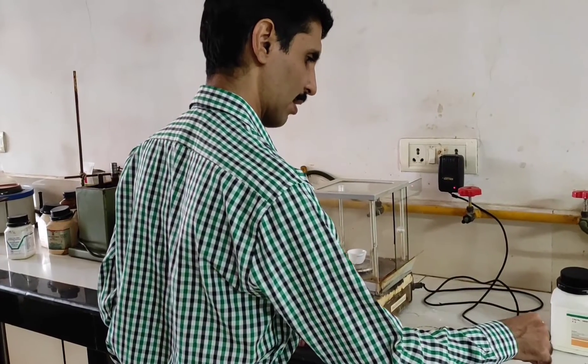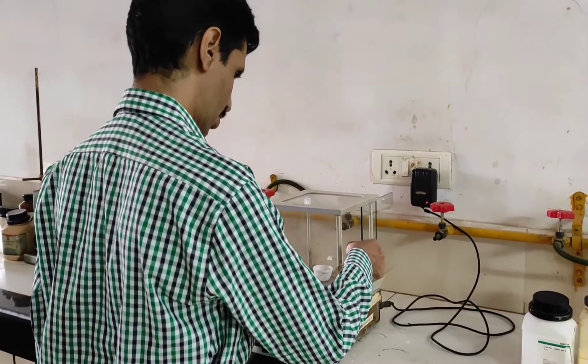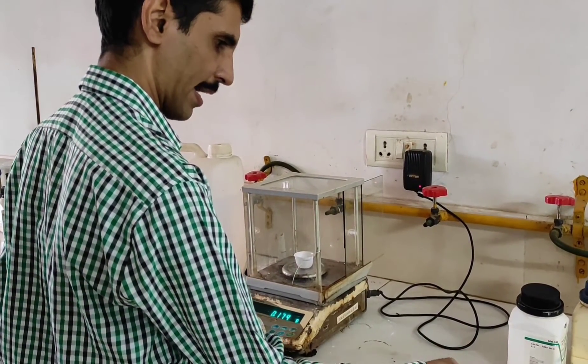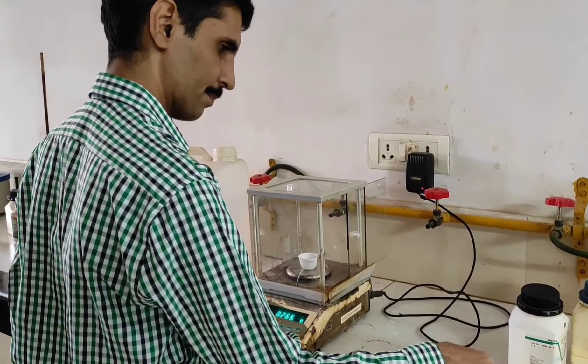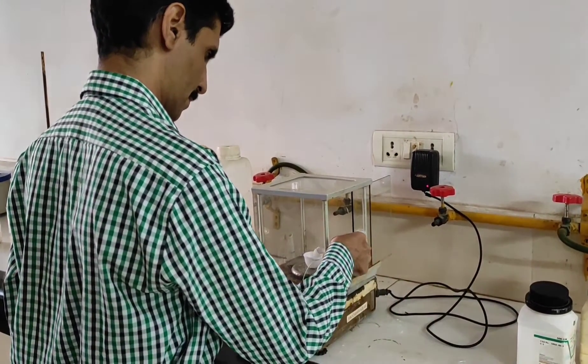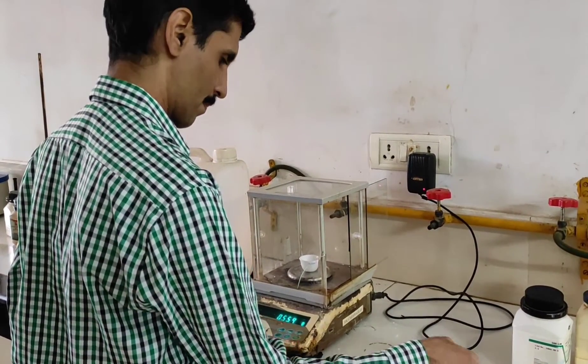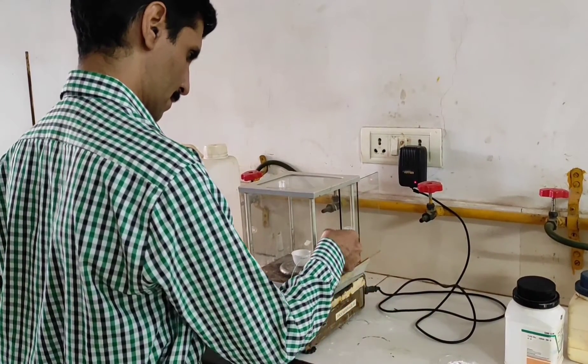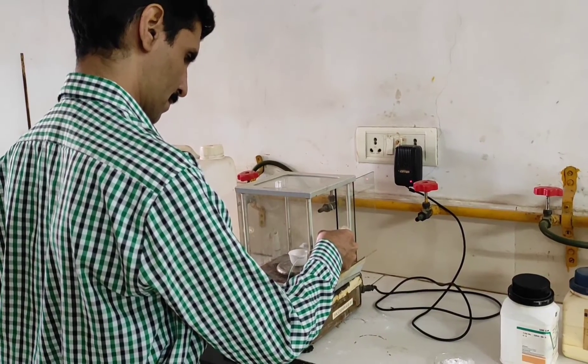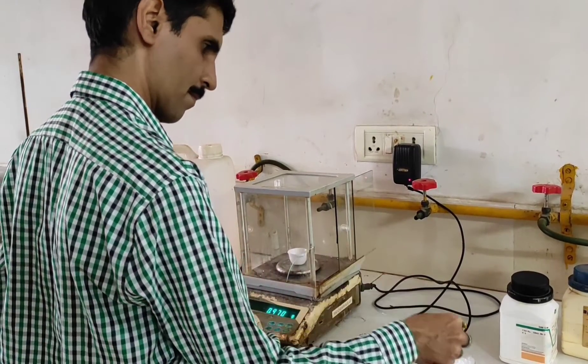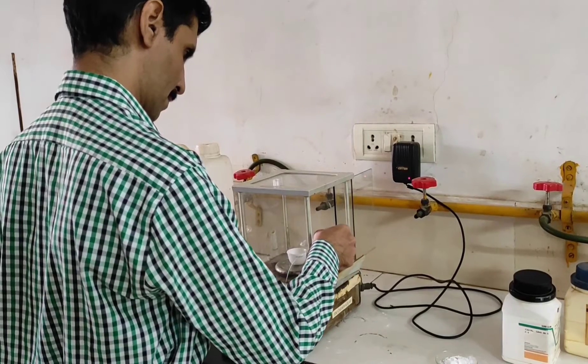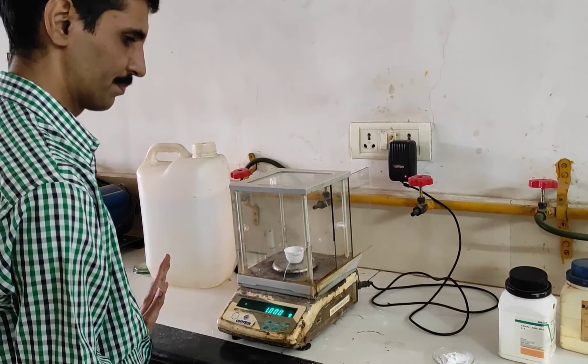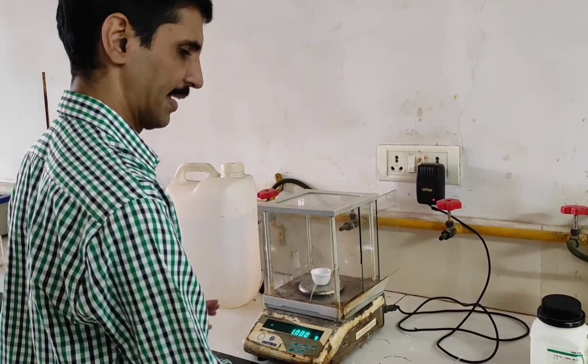And now, I will be adding very slowly the mixture into the crucible. So this is it, my dear friends. We have one gram of the mixture. And we will proceed for the heating process.